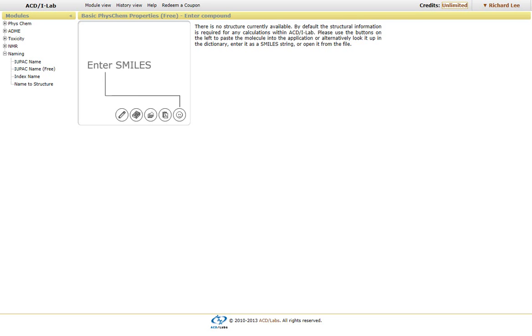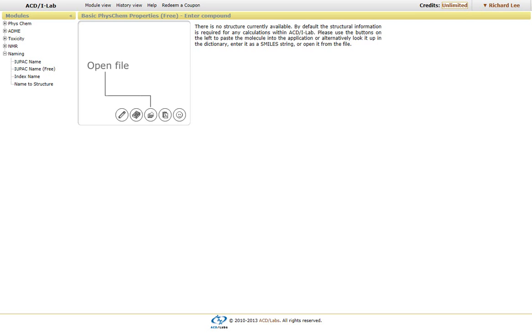This video describes how to use the ACD Labs iLab interface to generate names from structures.